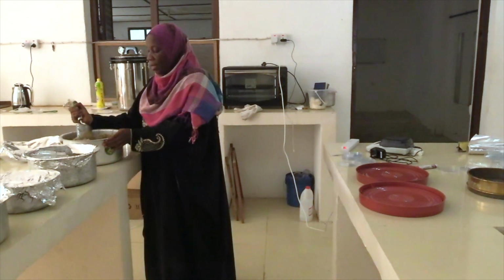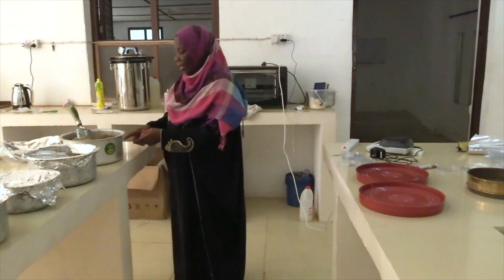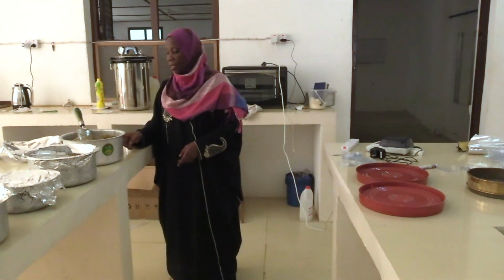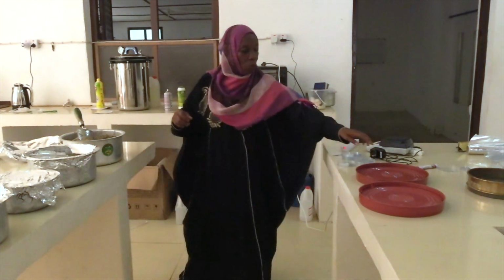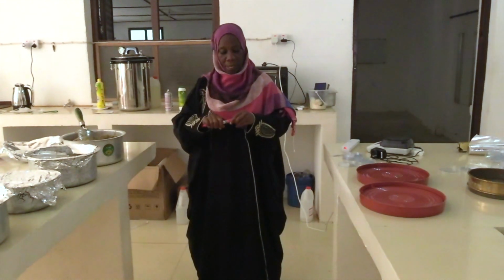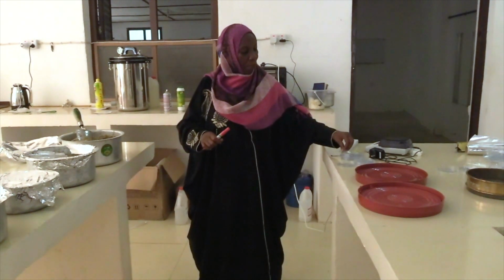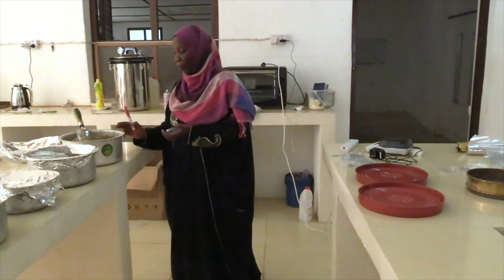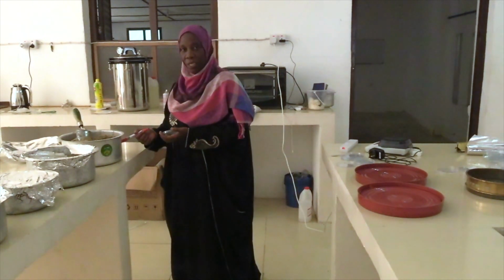Then I think this is ready now. And before that, you can use the number of the content. This is station number 5. So we take a marker pen and take a sample, and you put the number of the replicate before. You can't forget the number of each replicate.